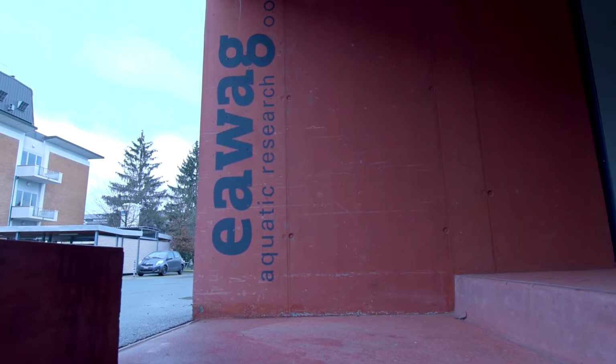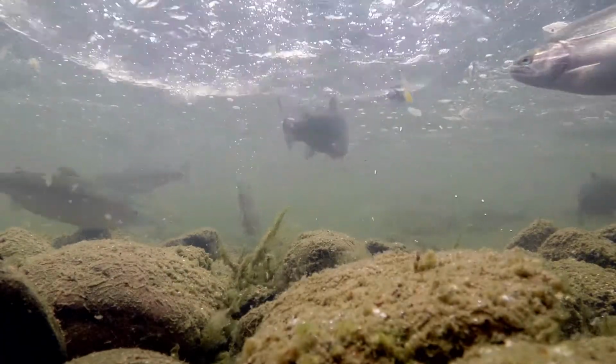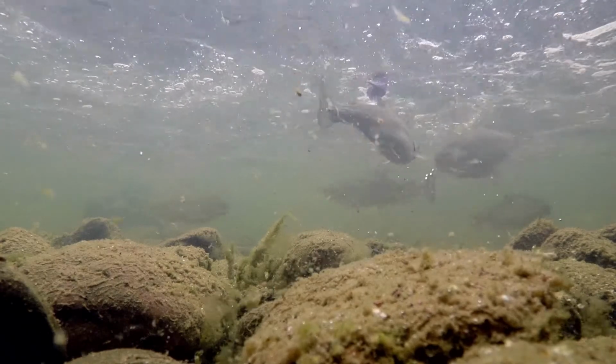Now at Eawag, we have been thinking for quite some time that this is not needed anymore. There should be better ways to test chemicals for their acute toxicity to fish. The solution that we have come up with is actually to use cells of fish. Cells that were once isolated actually from the gills of a rainbow trout.